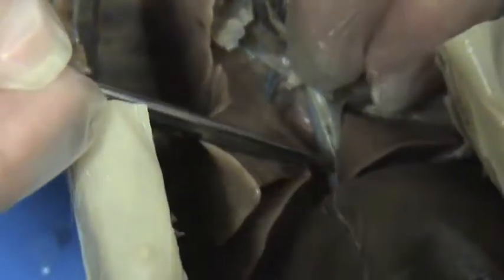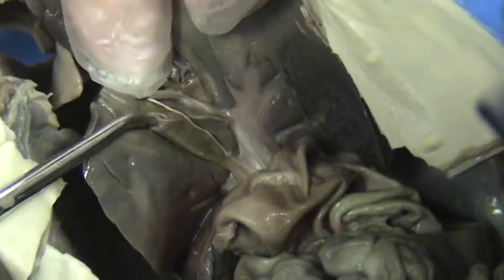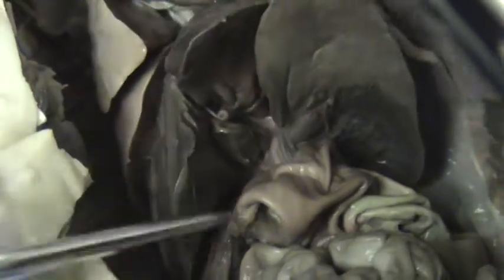Okay, from below, what's this big blue one coming up from below into the right atrium? Inferior vena cava. Okay, it starts all the way down here, and we'll look for it again in a minute, but that's a good place to find it. Okay, lungs, liver. Where is it? Gallbladder. A lot of the pigs, it's a real bright green, not so much on this one.